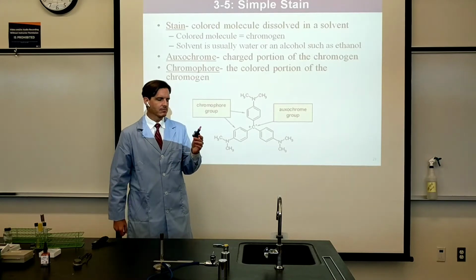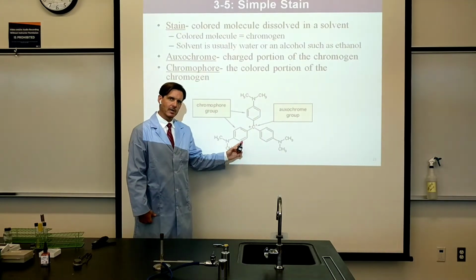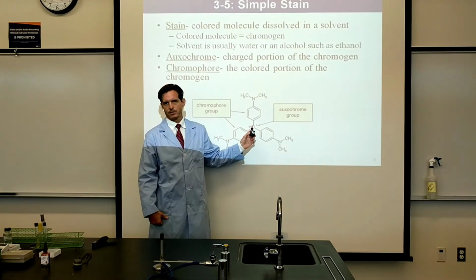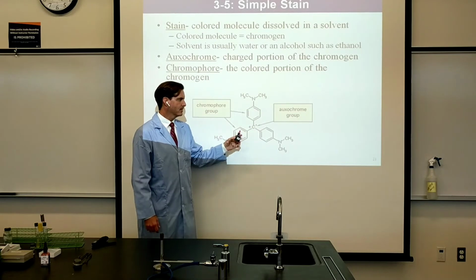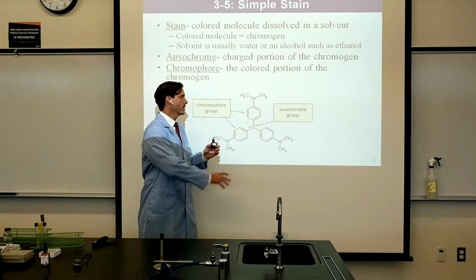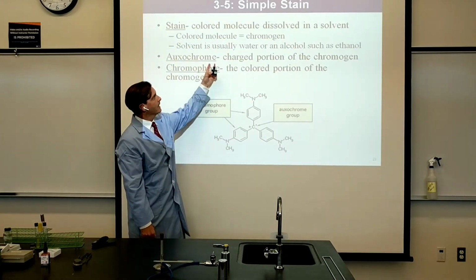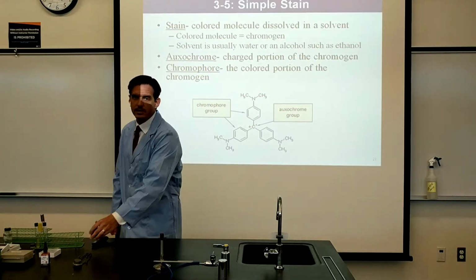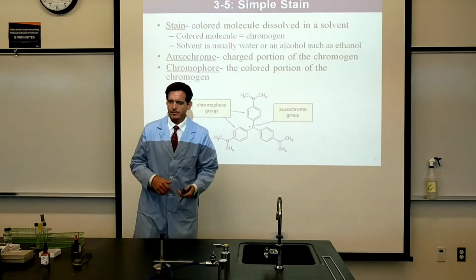They'll soak up the blue color, and you can see a picture of what the molecule looks like. This is actually a molecule of crystal violet, a different dye, but regardless, we're going to look at this molecular structure a little bit. It's very similar to methylene blue, and we'll see how this works to colorize cells that we want to study in lab.